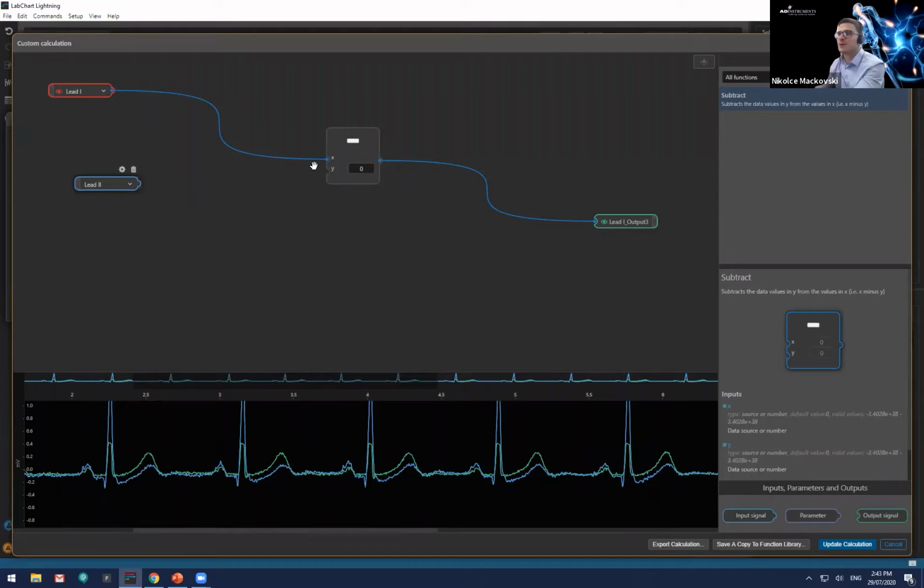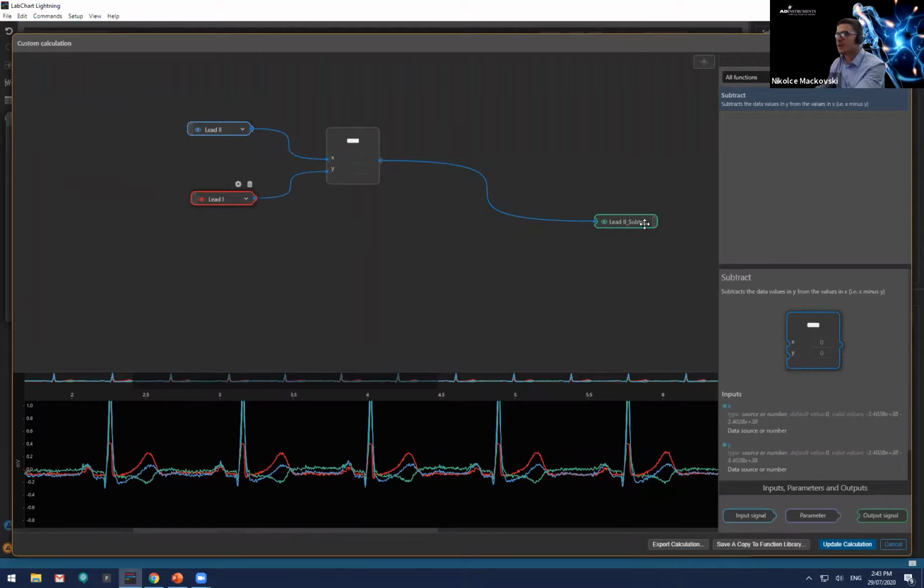To do that, the first step is I want to move this signal down to the Y notch like that. I left click and bring it in like that. We just click from here and bring it to the notch. Now I can make this a bit simpler to see, and just bring that in. You can modify this however you like. We have the mouse wheel as well, or the trackpad. You can zoom in and out depending on how large the calculation is.